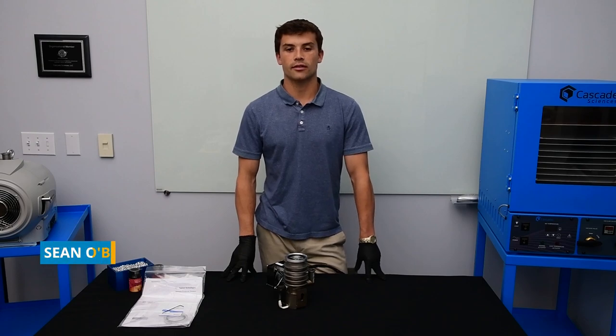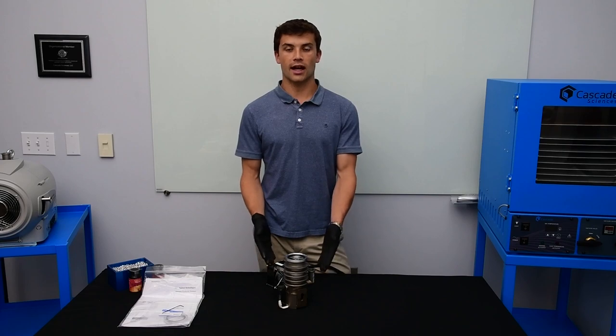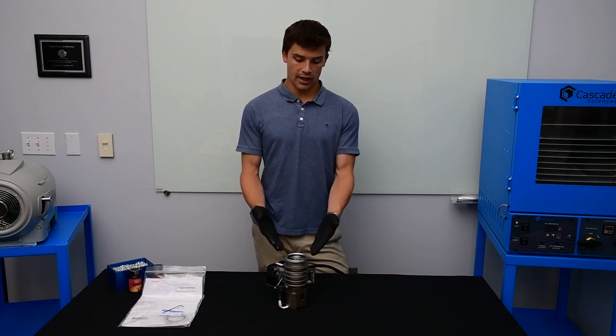Hi, my name is Sean O'Brien and I'm from Agilent Technologies. I'm here today at Cascade Sciences to talk to you about the Agilent AX65 Diffusion Pump. This is a high vacuum pump that works in pair with a backing pump. The backing pump attaches to the foreline and deals with the large gas load at rough vacuum. As this is a high vacuum pump, it will have more pumping speed in the high vacuum range.